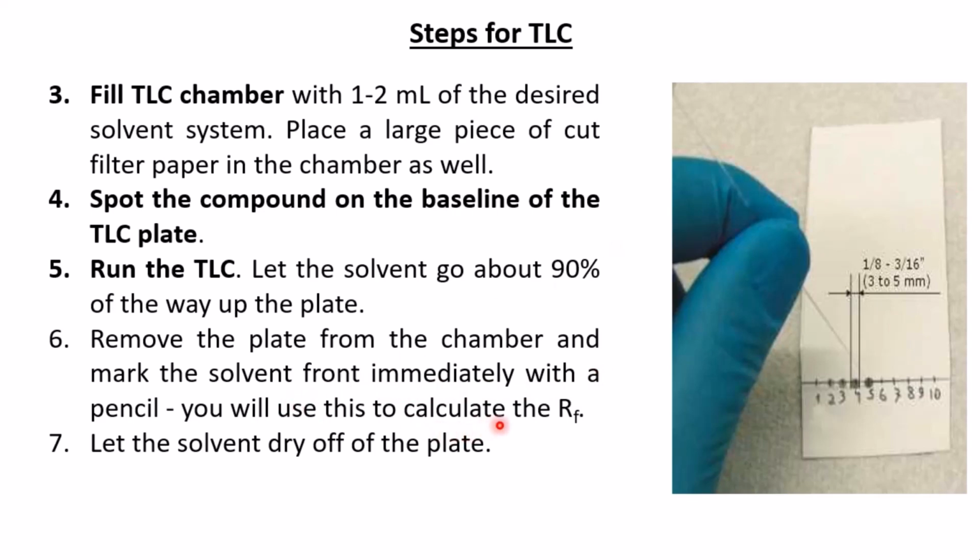So wherever your spot got to in the plate, you divide that over your solvent front, and then you calculate your RF factors, right? So there are cases where it's difficult to see your spots, then you use other techniques to do your visualizations, and you'll be looking at them shortly.